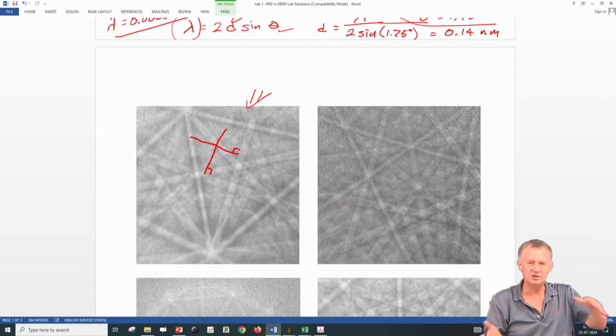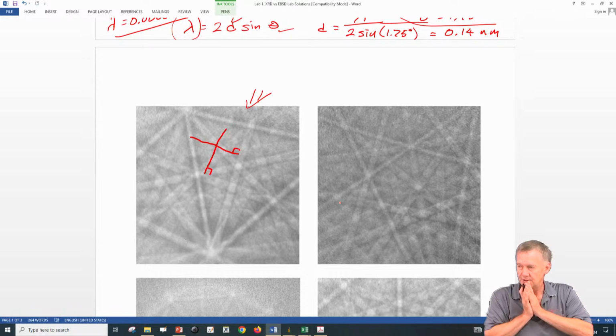That's just the geometry of how the projection goes, right? It's projecting out from the pattern center. So we need to look for the narrowest part, and make it normal, and then another narrowest part, and make it normal, and maybe another. Right, exactly. So geometrically, that's one of the ways you do it.